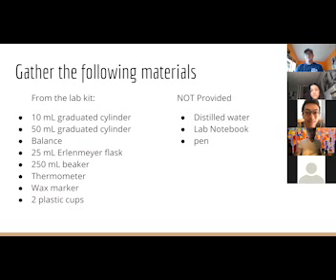I guess a 250 mil graduated cylinder. There you go. Yeah, you'd use a big graduated cylinder, either 250 or 500. You can get 500 mil. You can get 2-liter graduated cylinders. You can get really big graduated cylinders, and that's what you use for measuring large volumes when you need to have an accurate volume. I would use this if I don't really need an accurate volume.